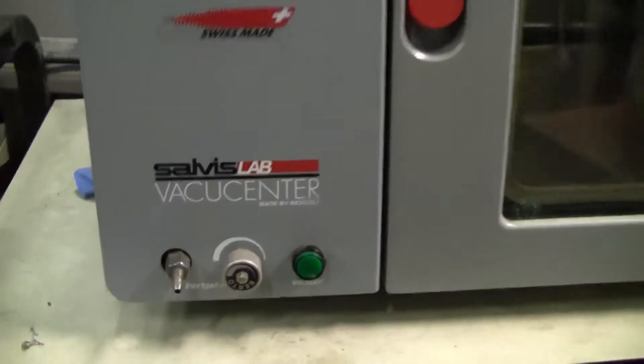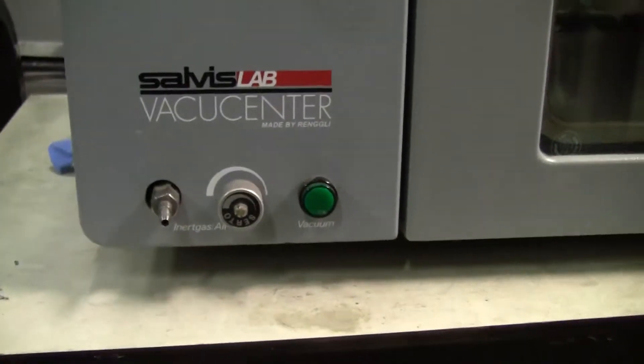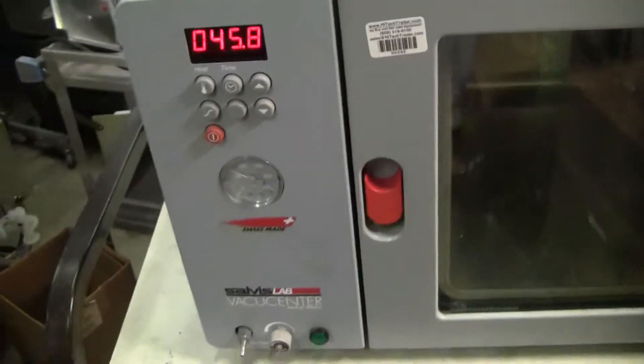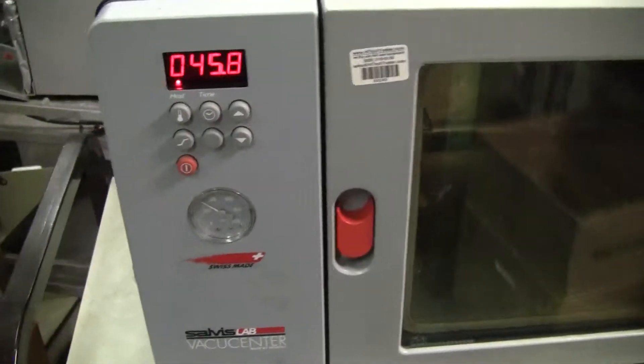On the bottom here we also have an inert gas in. Holding quite nicely, that's your door. Let's just release everything. Let's see the vacuum coming down.